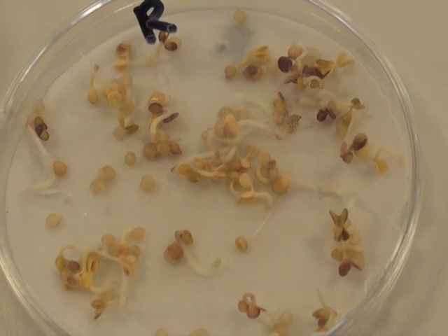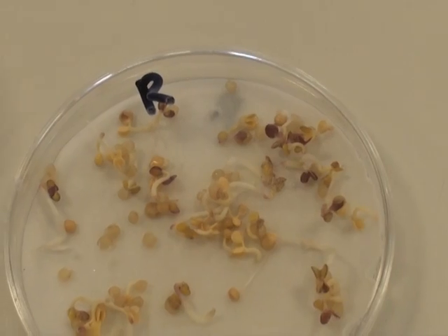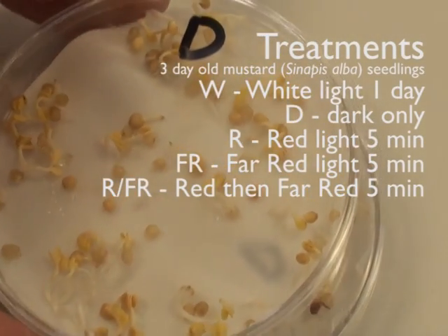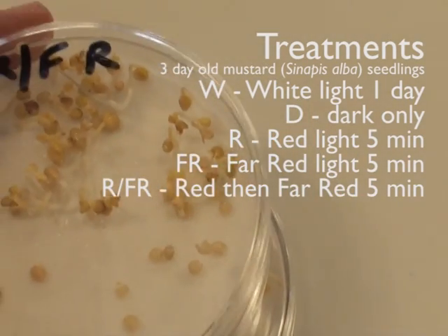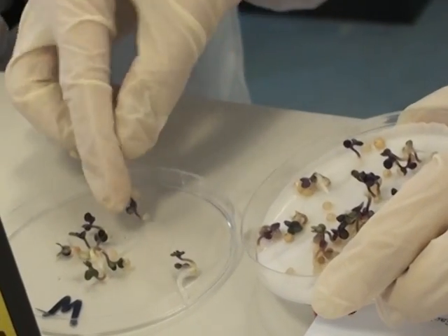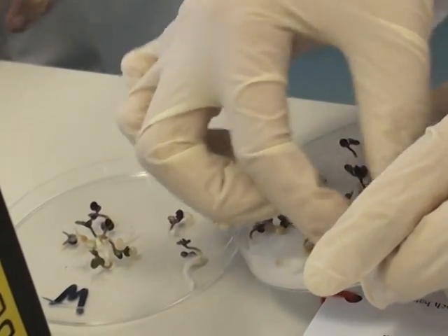Here we see seedlings of mustard which have been treated in white light or given a five-minute treatment in red light. Then we have others that have had treatment with far red light, just in dark, or with red followed by far red. Different light treatments with different qualities or colors of light.